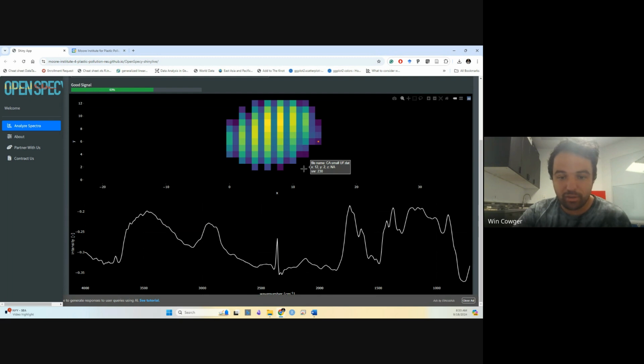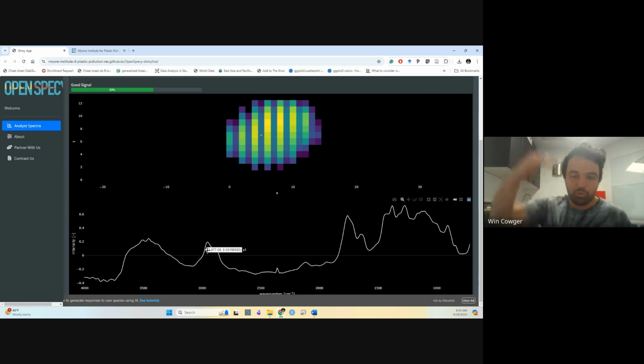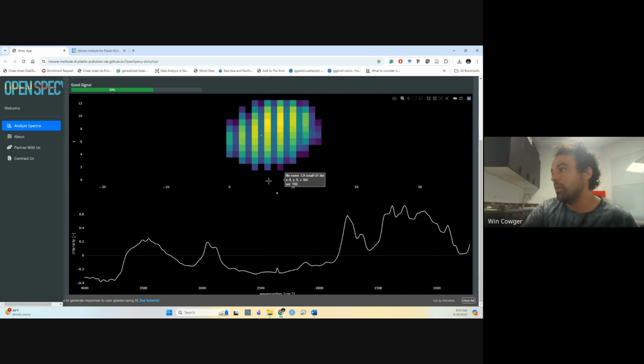That's a very classic approach, which is basically the highest peak divided by a low region. So what you want is a really big peak and a really low flat region in your spectrum.